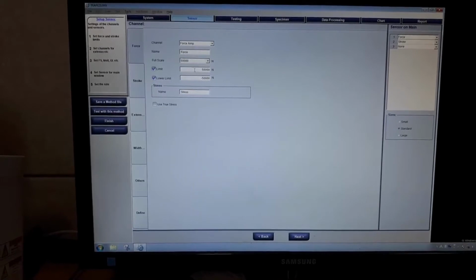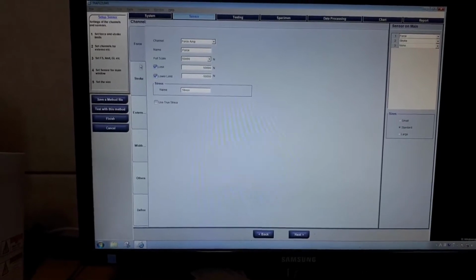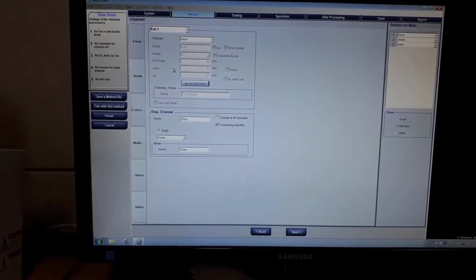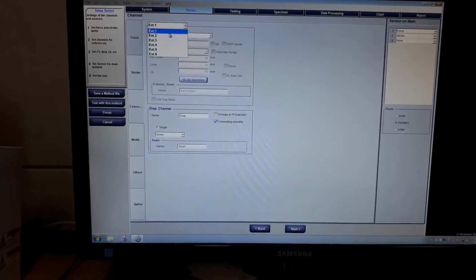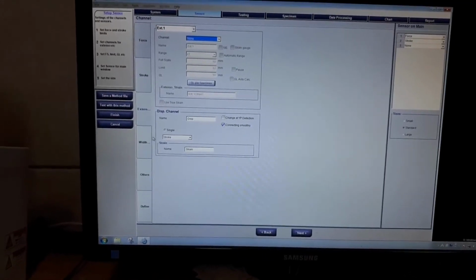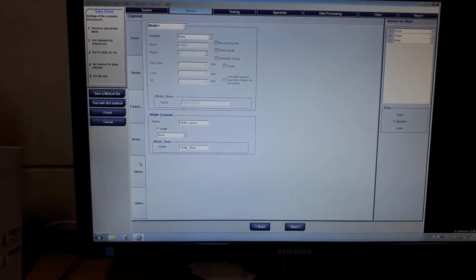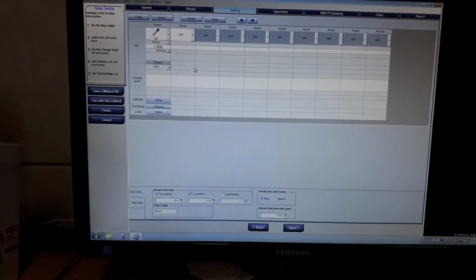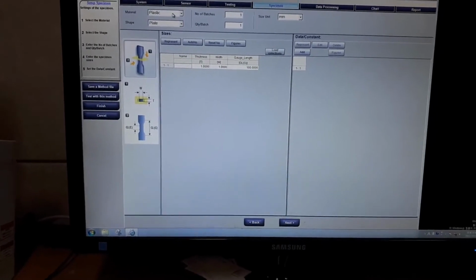For sensor, the limits here, just leave it like it is. Stroke, leave it. Extensometer: normally we have an extensometer, but it's broken now. But if it is fixed, you can use the extensometer here by clicking on extensometer 1 channel. Leave it. Displacement and stroke, strain, width, nothing here. For testing, next, nothing you need to change.